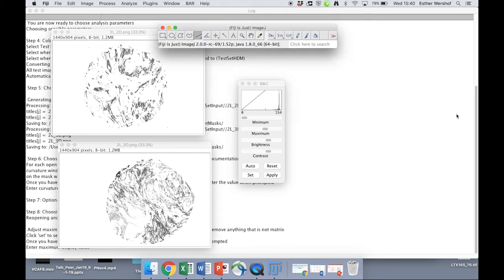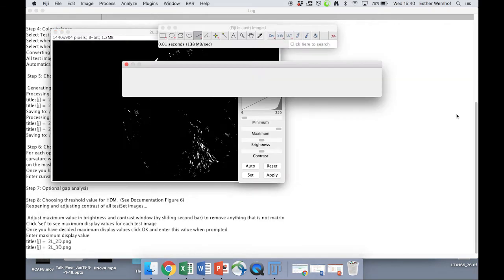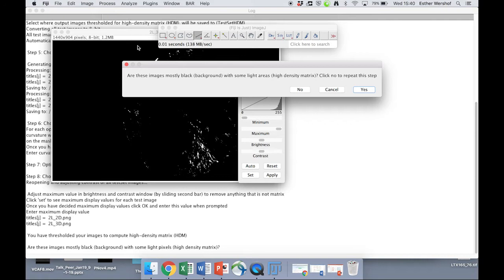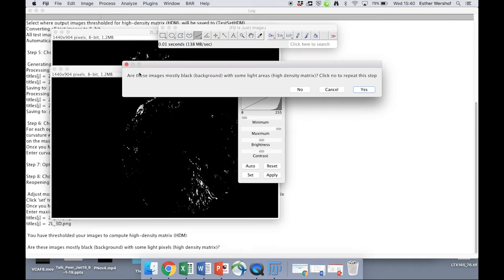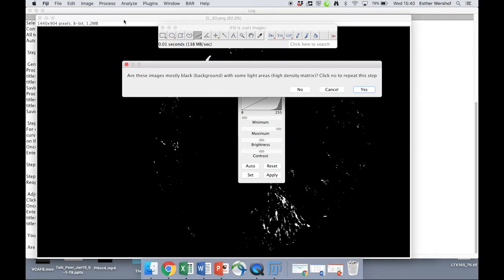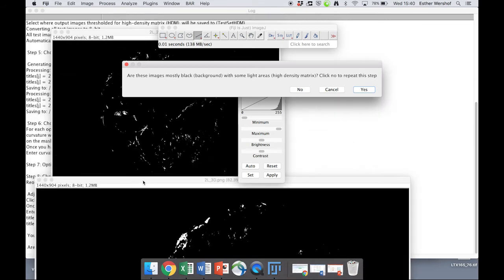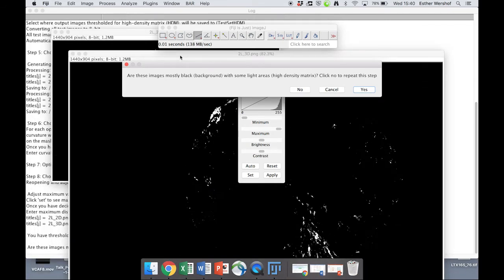So we're going to enter a value of 150, and it's going to do that HDM processing. It's going to ask us, are these images mostly black with some light areas? And I would say yes, they are.